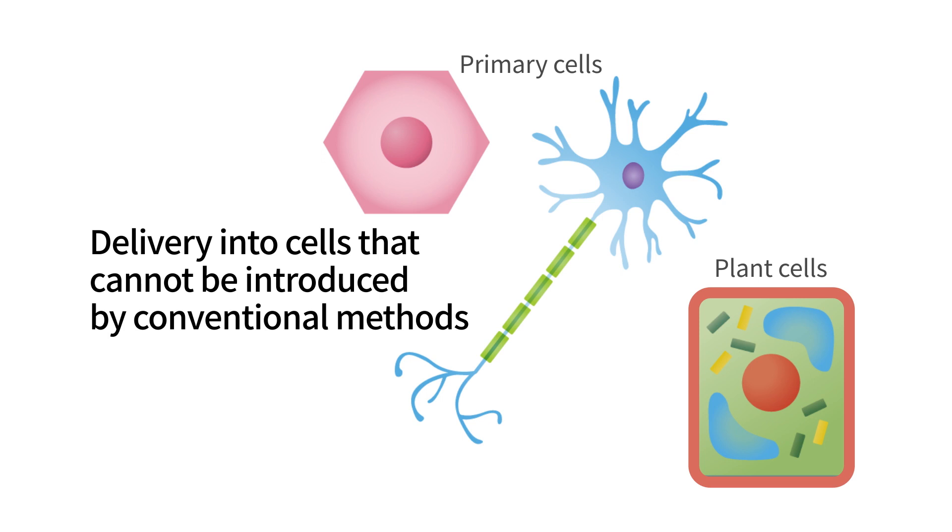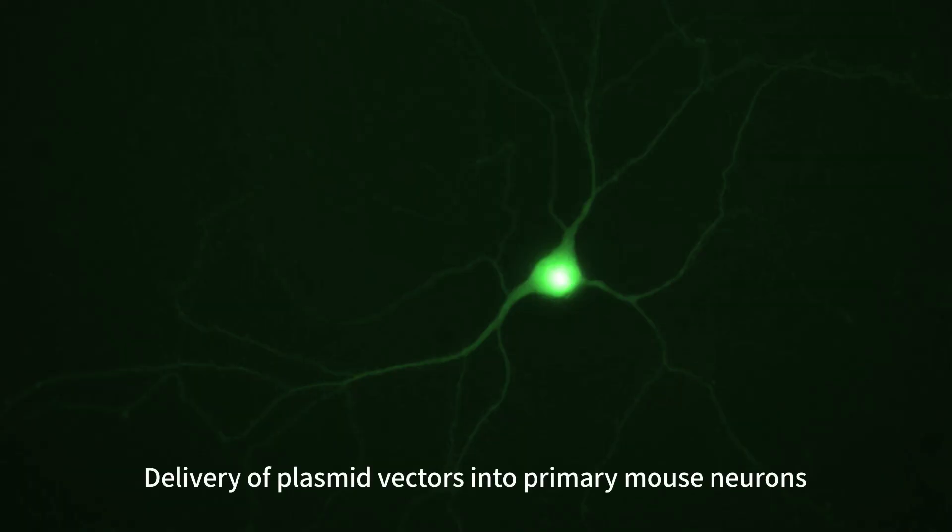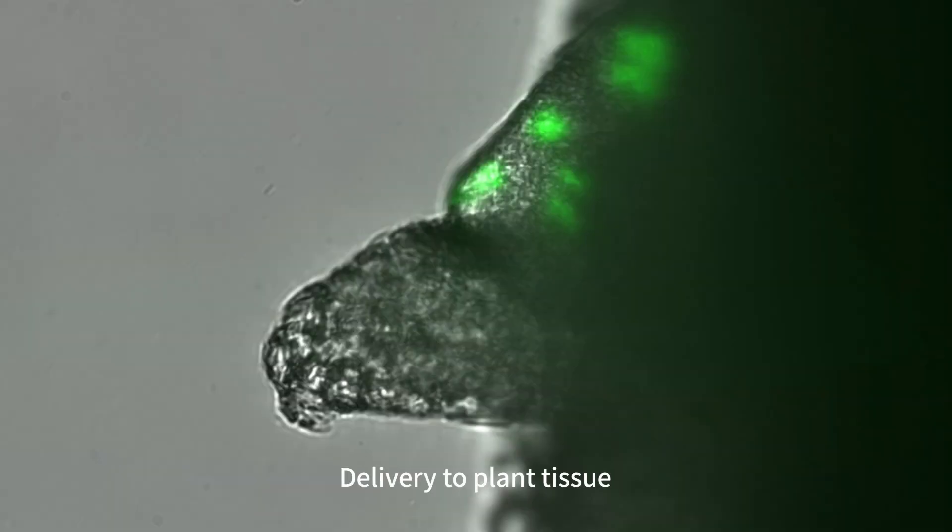Even normally difficult cell types can effectively have materials delivered intracellularly by the SU-10, such as primary nerve cells or the shoot apical meristem of plant tissue.